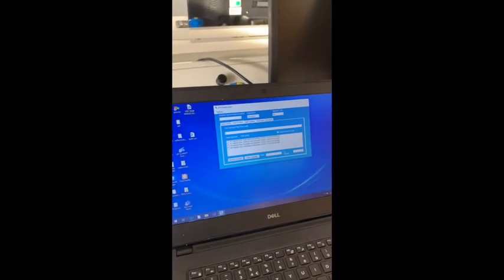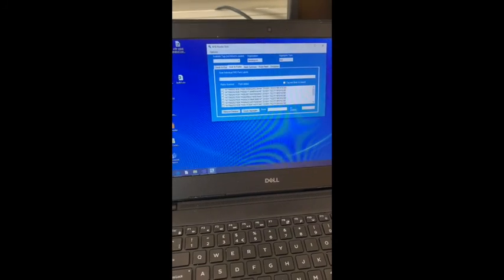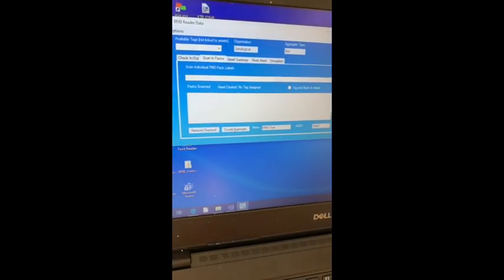We will now demonstrate creating an asset in the lab. First, we will scan the product packs. In this scenario, the product packs are already loaded in the aggregate. As you can see, as the operator scans the product packs, the screen is updated with the details of each product pack. At the end of scanning the product packs, the operator enters the asset details on the screen and selects the Create Asset option. The database is updated accordingly with the new Asset Product Packs mapping. That is the end of the Create Asset process.